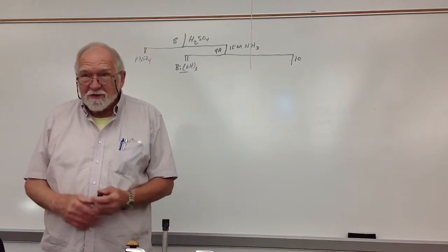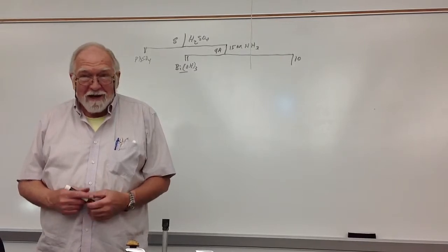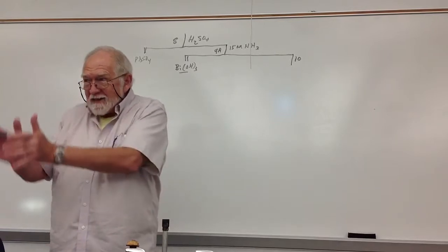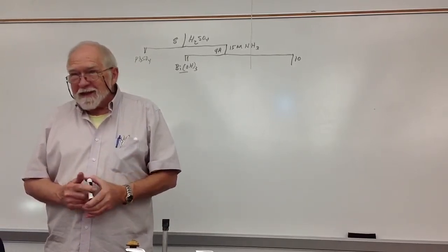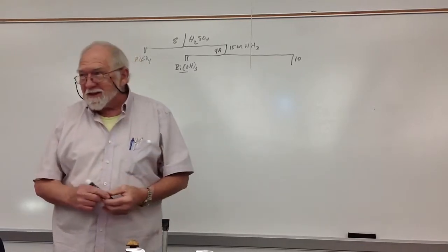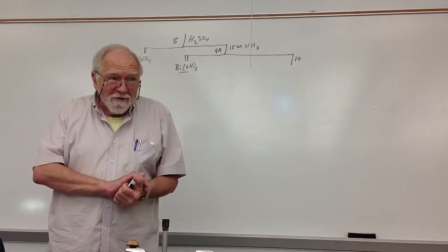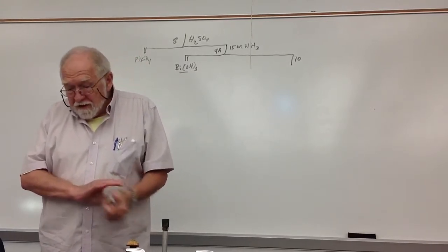The other thing I do to help, which doesn't matter because people mix them up anyhow, I put the bases on one side of the sink and the acids on the other, for both sinks back there. When I'm finishing up at the end of the day, I find all the acids in the middle somewhere, and some of the bases here and some of the bases there. That's your worry. If you put them back where you find them, they might be easy to find.